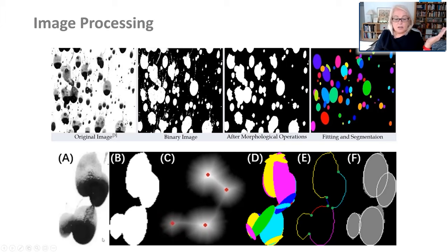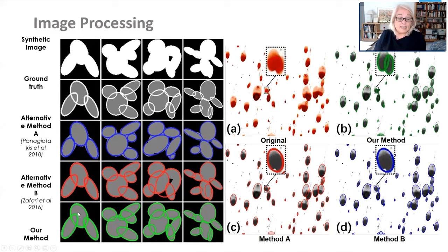Once you have the ellipses, the question is, how do you fit ellipses to a bloodstain pattern? That was the first part of their work. And in that first part of their work, they came up with an algorithm that, we're looking at the green over here, given a ground truth pattern of droplets, actually does fit the corresponding ellipses pretty well.